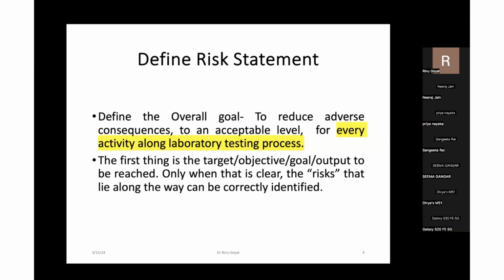So first of all, when we hear this word risk, sometimes people say that there is a risk in every activity. Whenever we are working in laboratories, there are so many processes, so many procedures, so many things we are handling. So we should assess the risk associated with the activities, so that these activities would not result in harm to the patient, to the employees or the staff, to the patient reports, to the users.